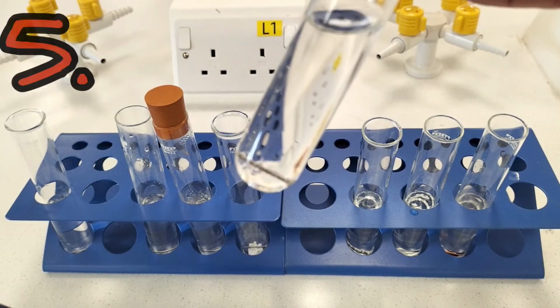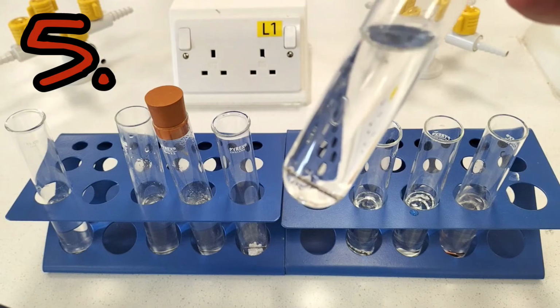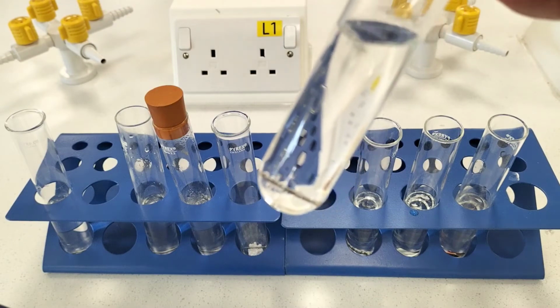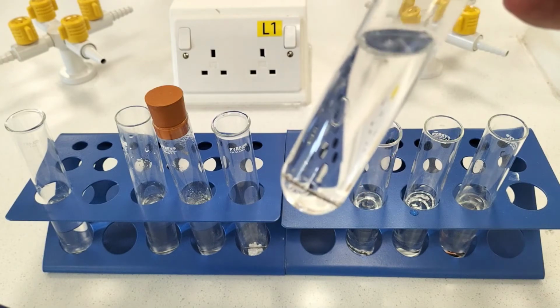Now in experiment 5, the actual nail looks a bit blurry. Do not adjust your set, that's actually on purpose. I've coated this iron nail in petroleum jelly, which is a thick, viscous, oily layer completely surrounding and encasing that iron nail. We're going to see if that makes a difference to the rate of rusting.